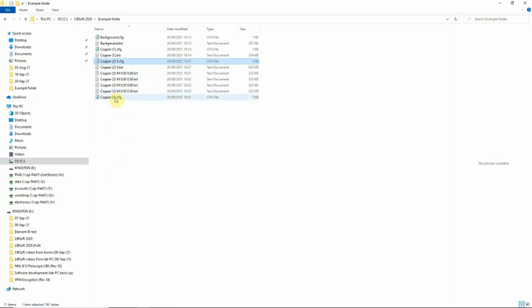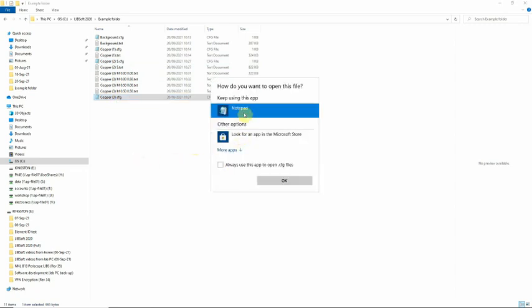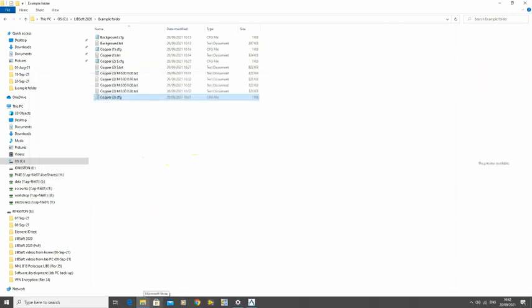Again, a configuration file is also saved detailing the parameters used for the acquisition. A single configuration file is saved as the parameters used were the same for all of the 4 measurements, and the file includes details of the number of measurements made.